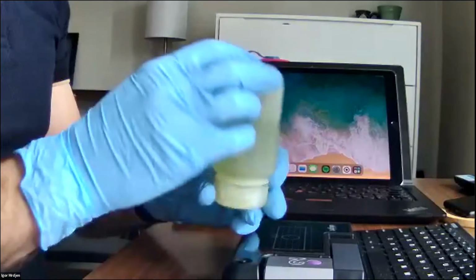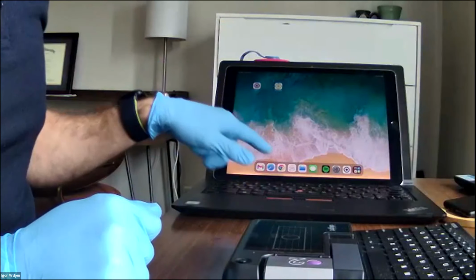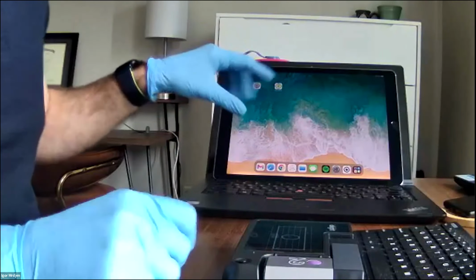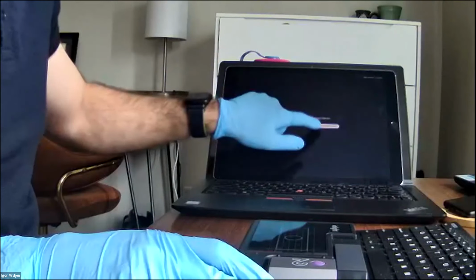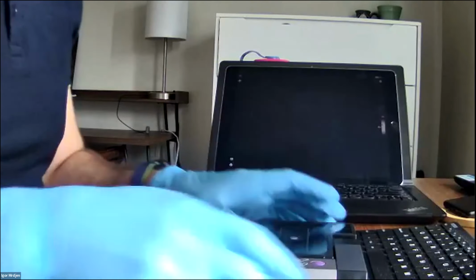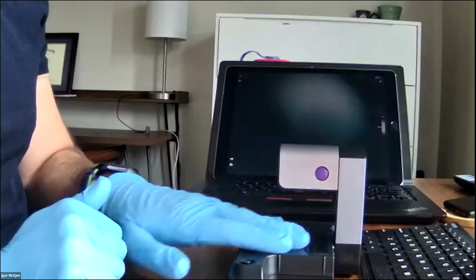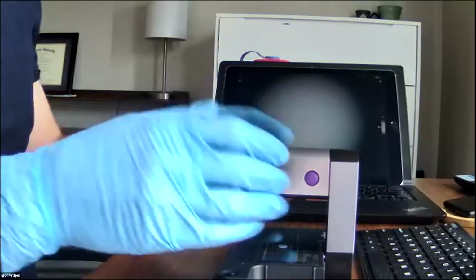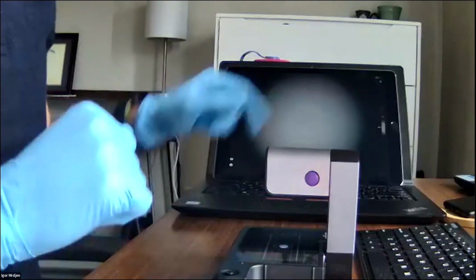So here's my sample that I have collected. I'm just going to homogenize it a little bit. And for the sake of this demo, I've already connected my iPad here that is anchored onto my laptop because my stand broke. I've already connected it to the Wi-Fi that the microscope generates. So I'm just going to open up the ioLight app and connect to the device. And you're going to see my screen stay black for a little while. Okay. Now I'm going to deploy the swing arm up, and you can now see the condenser. And as my hand passes underneath, now you can see that the iPad is becoming the view piece, and the camera here that is in the mast is basically transmitting this picture onto the iPad.